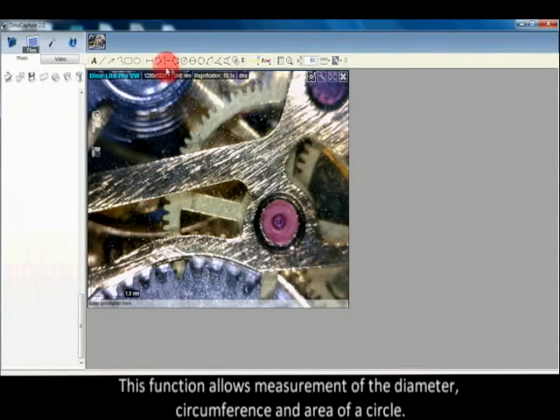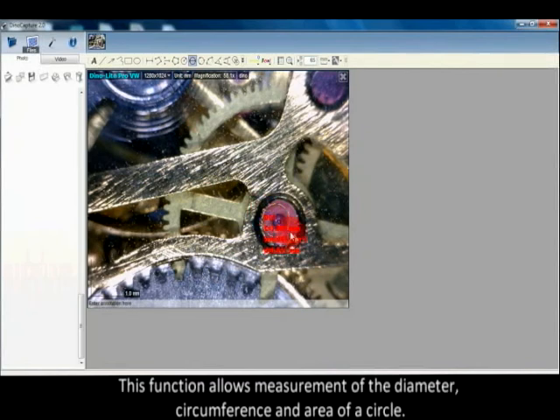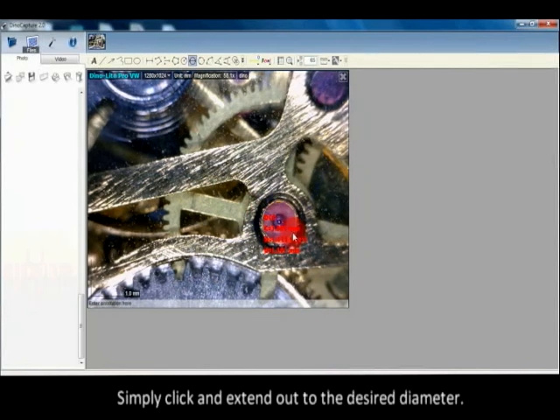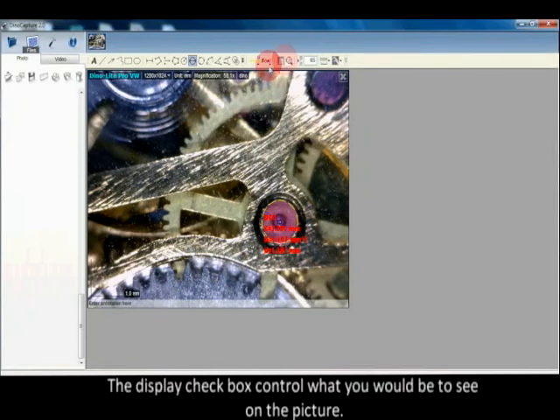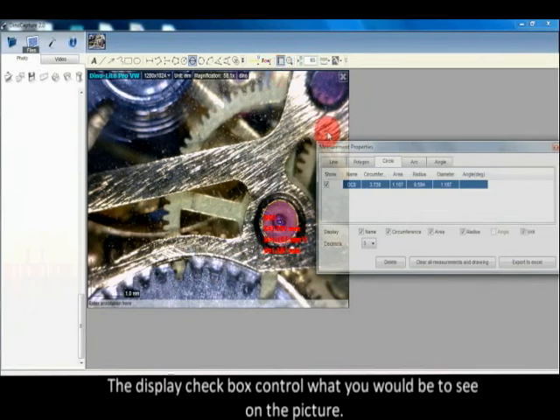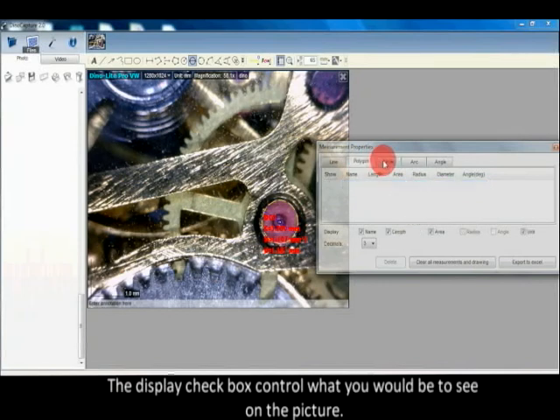This function allows measurement of the diameter, circumference, and area of a circle. Simply click and extend out to the desired diameter. The display checkbox controls what you would like to see on the picture.